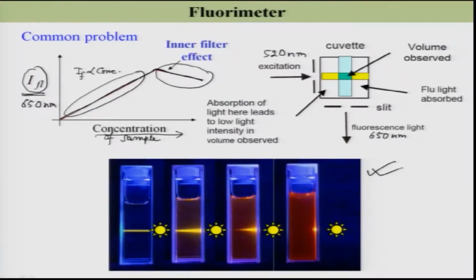When your solution is dilute, this excitation light will completely pass through, like this way. And as I said, this is the geometry of my excitation. In this case, I excite like this and emission is collected from the mid part of this excitation.